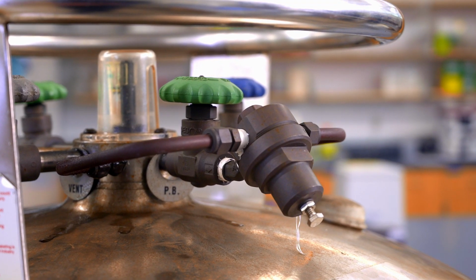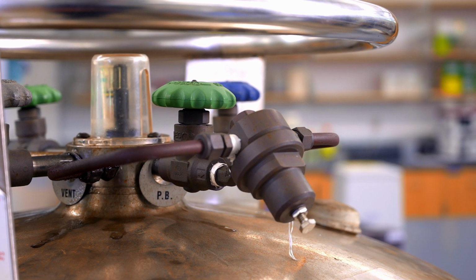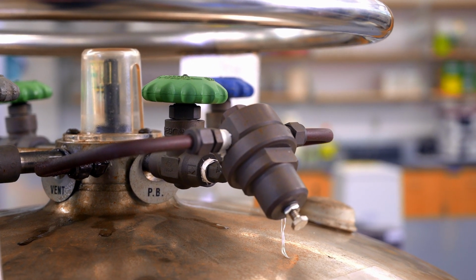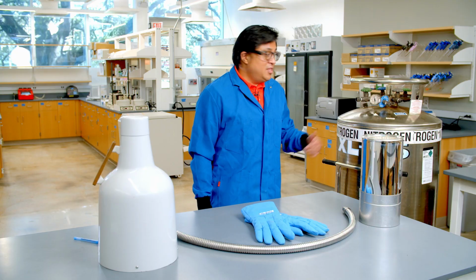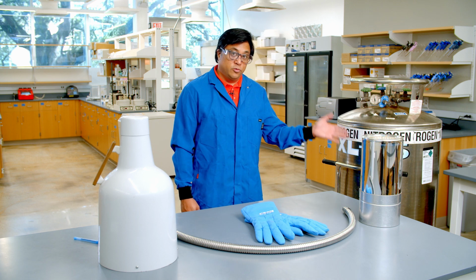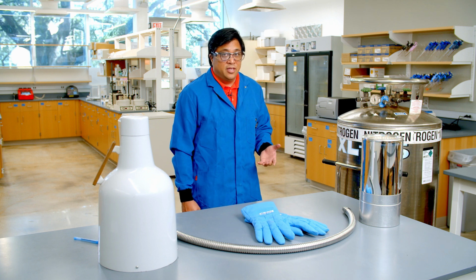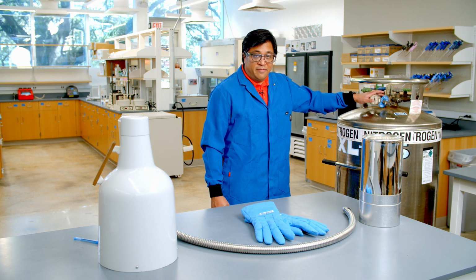The pressure builder valve is used to maintain the dewar pressure when there is a significant draw of gas. This valve is not normally used, but it is available if your system needs it. And finally, we have the pressure relief valve. If this tank gets to a certain pressure, normally 230 or 280 psi, it will want to release some of that pressure. Now that pressure is going to be released through this safety valve.